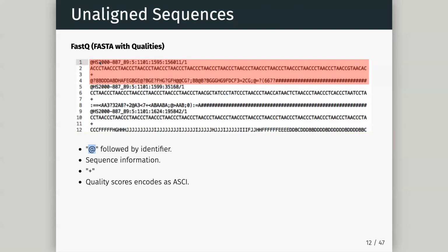And every single record corresponding to a sequence we have generated is 4 lines long. So we have 4, 4, and then 4 here. Each got their own header line. We then have the sequence information, which is the actual sequence as the Illumina machine has called it, just there in that second line. We have this plus, which used to contain some more information, basically the header line with a little bit more information, but not anymore. Now it's just a plus.